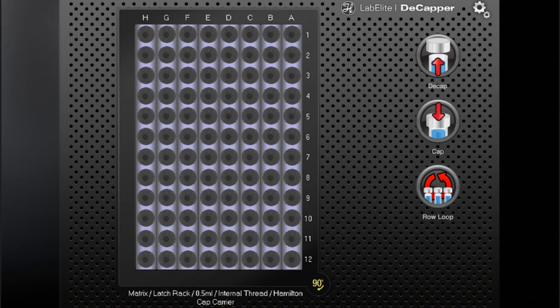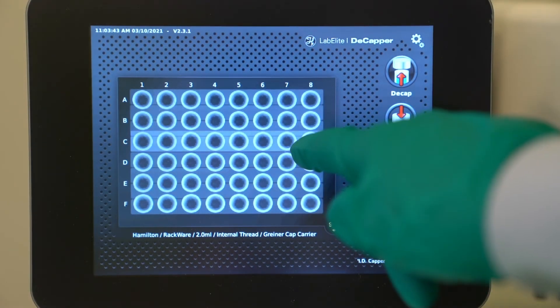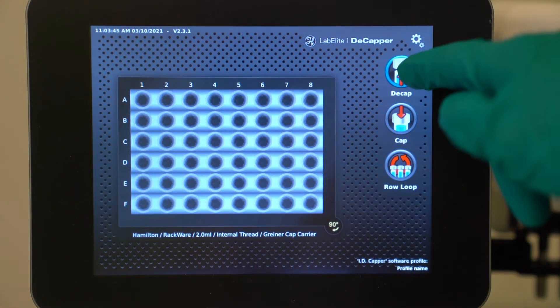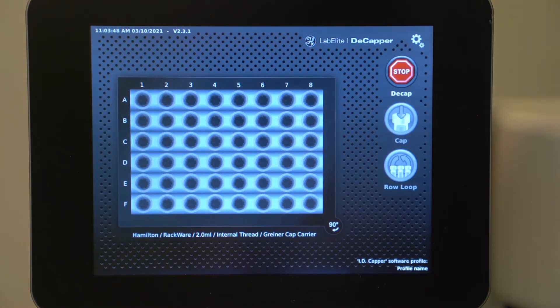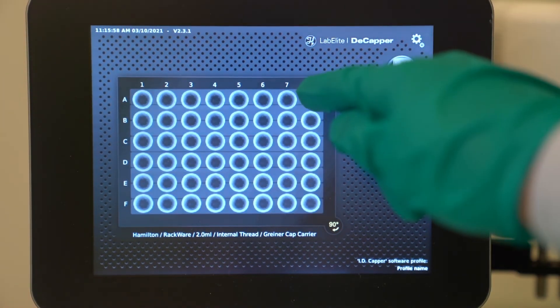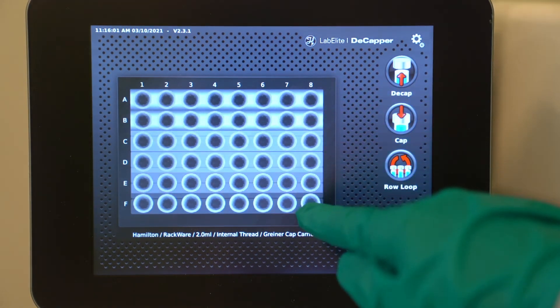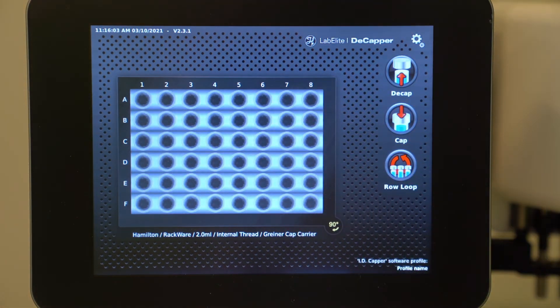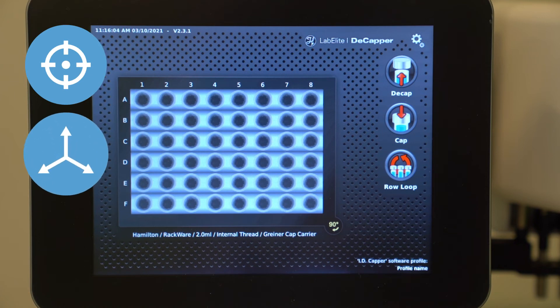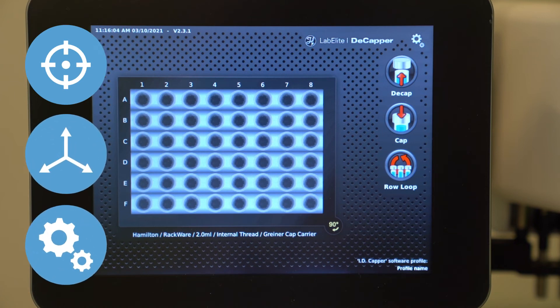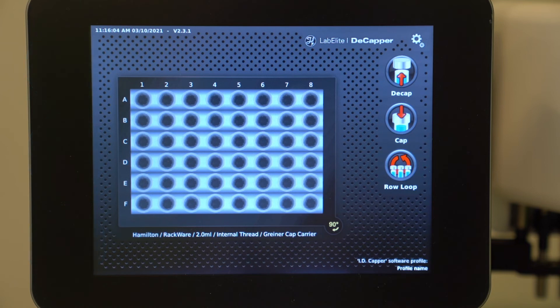On our iDecapper model, you will also see the read barcode button for barcode scanning. Now that the system has initialized, we'll select the entire rack of tubes and hit decap. Keep in mind, you could select one row, several rows, or the whole rack. Because we swapped the head, it initializes to recognize the associated firmware. While it initializes, the system checks the laser for alignment as well as the z-axis and other settings to ensure that everything is working properly. It's important to note the head only initializes once after it's swapped, not every time.